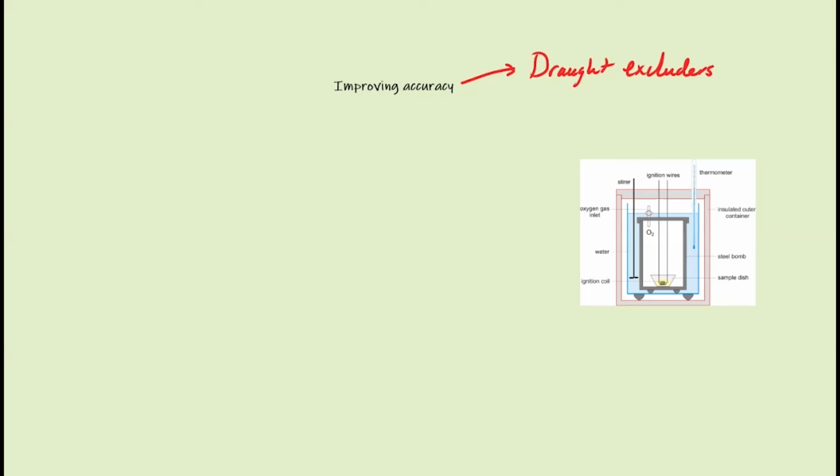The next one, which could be used for copper calorimeters or any other calorimeter, is quite simply to add insulation. You can add a foam layer around your calorimeter, as long as it's not a fire hazard if you're using a copper cup calorimeter, but if you're using a polystyrene cup calorimeter, you can add another layer of insulation. For both of those, you would also want to add a lid to stop that transfer of heat to the surroundings, or loss of heat.